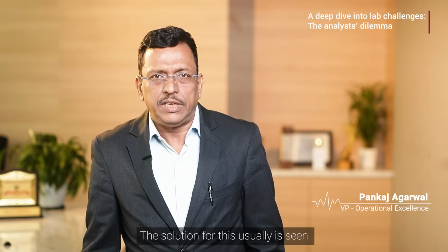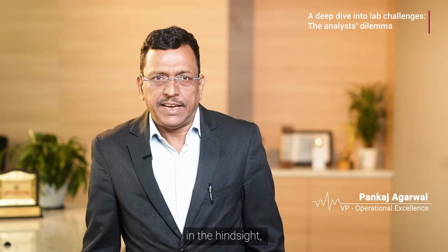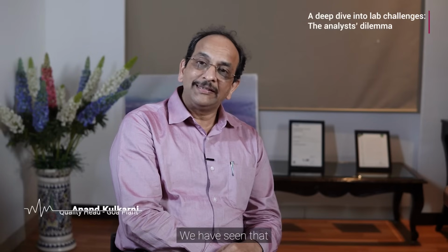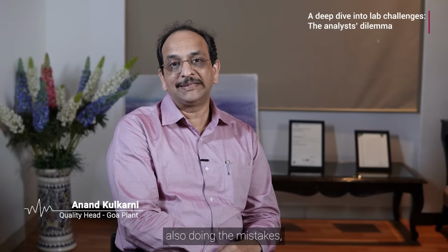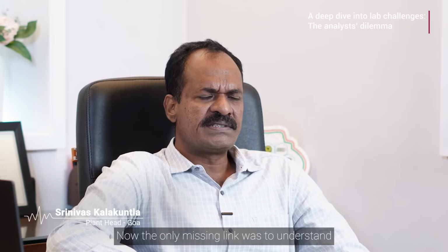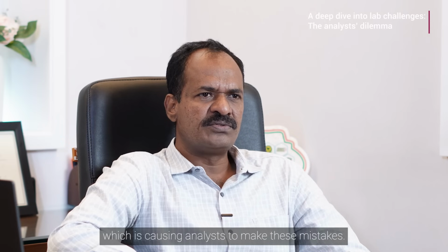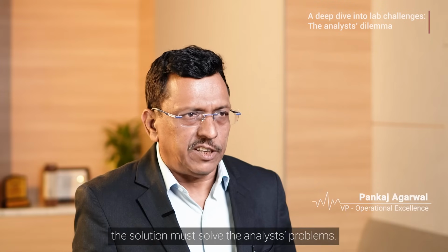The solution for this is usually seen as either more training or checklists. In hindsight, we observe that the same and similar mistakes continue. We have seen that not only juniors but also senior members are making similar mistakes. Now, the only missing link was to understand how and what elements exist in our environment, which is causing analysts to make these mistakes. We came to believe that the solution must solve analyst problems.